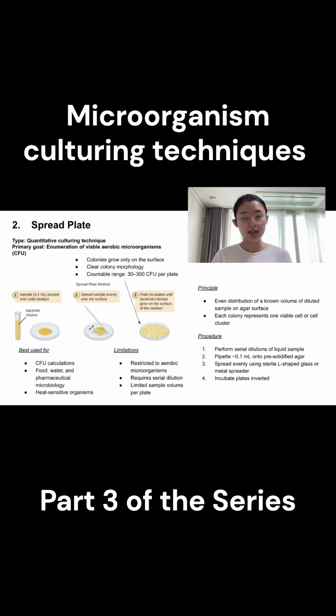The spread plate technique is commonly used for CFU calculations, and CFU calculations are applicable in food, water, and pharmaceutical microbiology, because the colony morphology is very, very clear and the colonies only grow on the surface. A couple limitations regarding the spread plate technique is that it is restricted to aerobic microorganisms and it requires serial dilutions, and there's a limited sample volume per plate, and this is because you're typically just spreading only a small volume of around 0.1 milliliters.